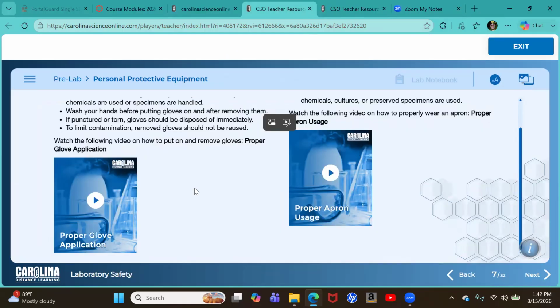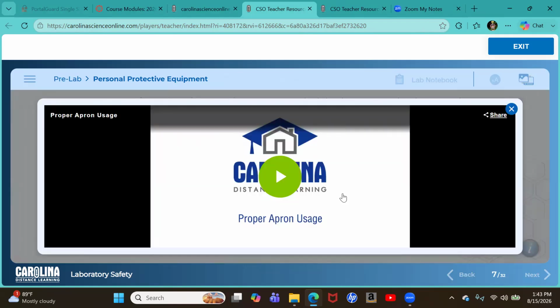Okay. I think your kit will come with at least 10 pairs, so 20 gloves. Yeah, because you're going to need at least four different sets of gloves. So for your two wet labs that we have, your kit will also come with an apron, very fashionable.